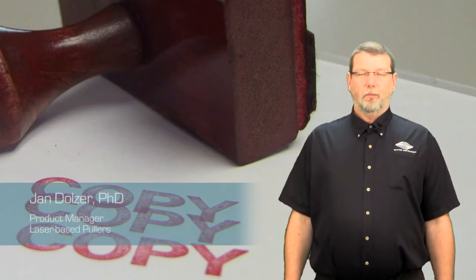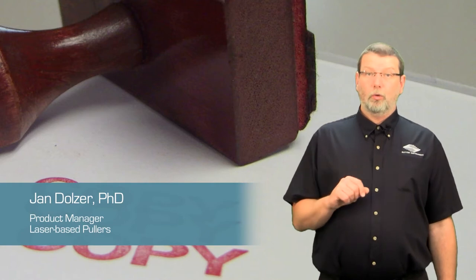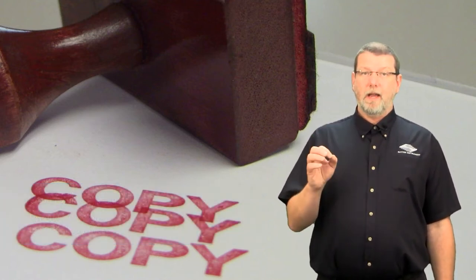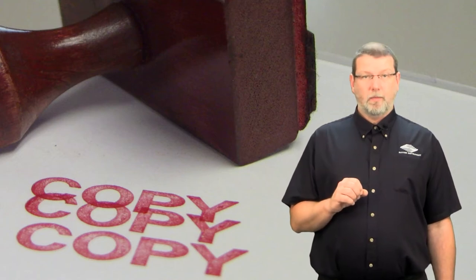Hi, this is Jan Dolze at Sutter Instrument. Today we'll show you a short tutorial about how to copy pull programs on your Sutter P1000 and P2000 micropipette pullers.